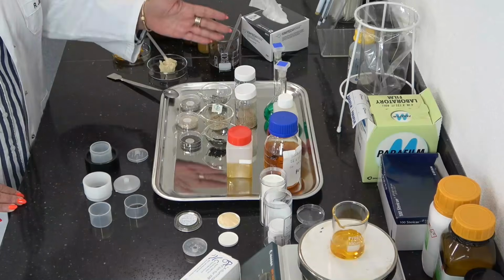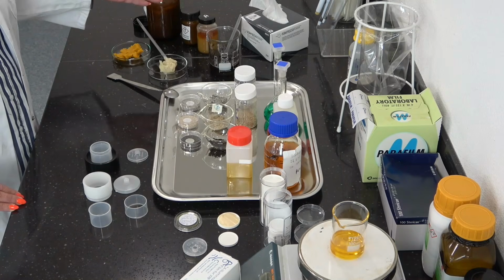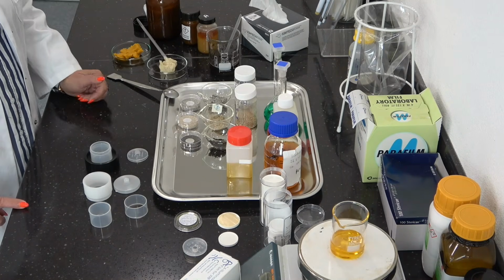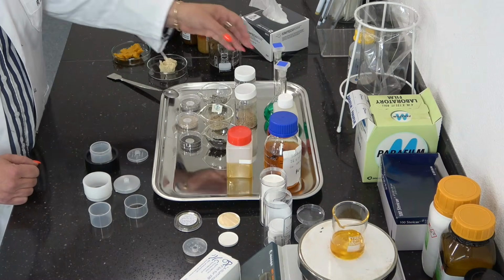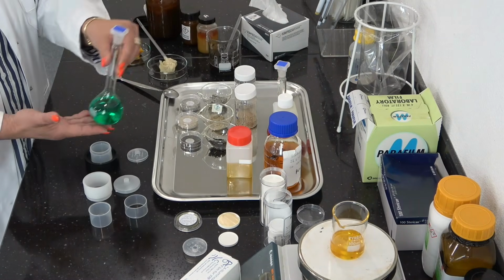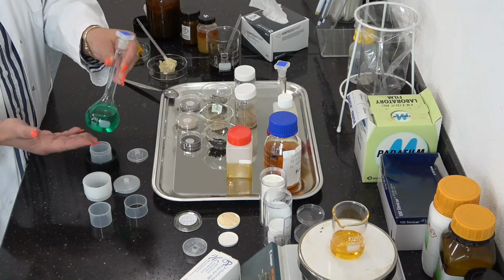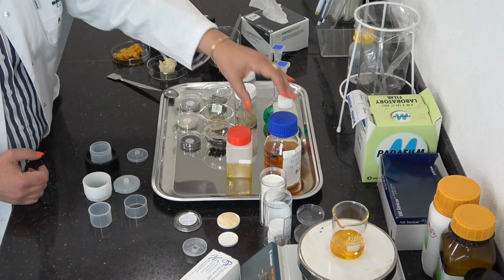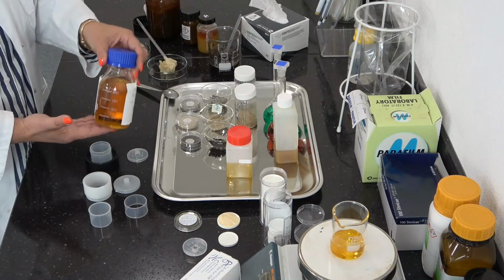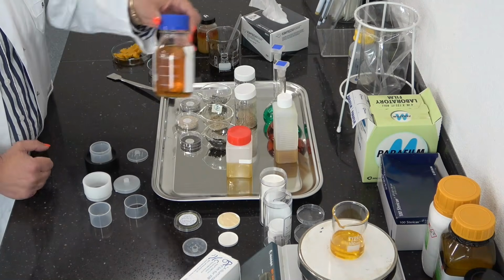For today, I prepared different kinds of liquid samples and also different kinds of complex, inhomogeneous samples. The easiest way to analyze liquid samples, for example, I do have here some samples like a homogeneous solution, like precursor or galvanic solutions, or maybe some mineral oil samples. Here I have a biodiesel sample or some water-based samples.